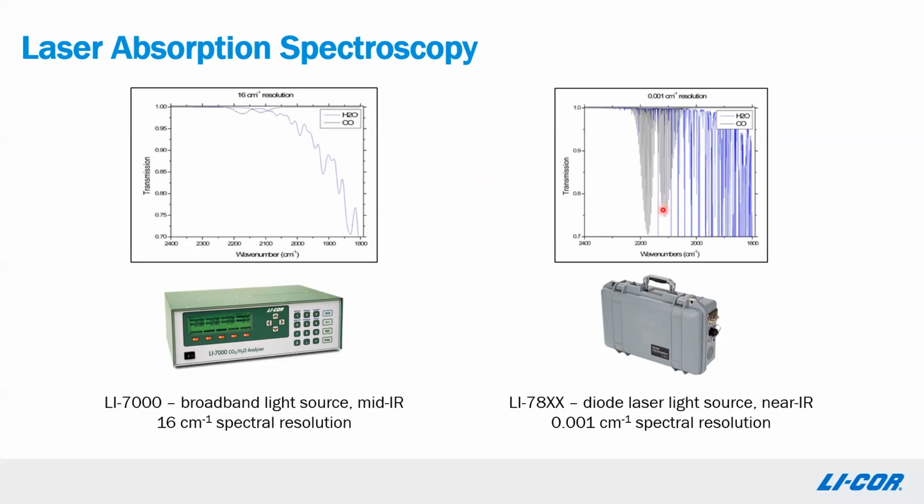Whereas for the laser-based systems, we can zero in on individual transitions of the molecule. So we can find a line that is, as best we can, free from interference from other gases that we would expect to find in our gas sample, like water, for example, which is everywhere in the spectrum there. So we can minimize interferences and also just zero in on the gas of interest.